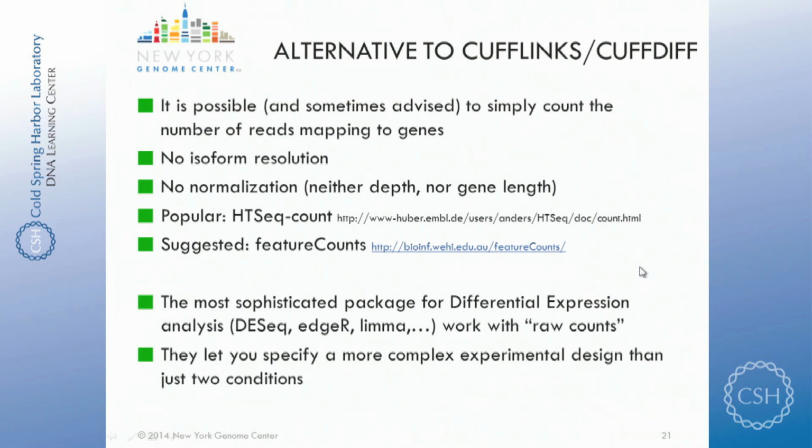And it typically takes, let's say, 20 minutes to count all the genes in a BAM file. So it depends on the size of the BAM files and on the number of genes you want to quantify. But that's a very efficient way to count the number of reads.